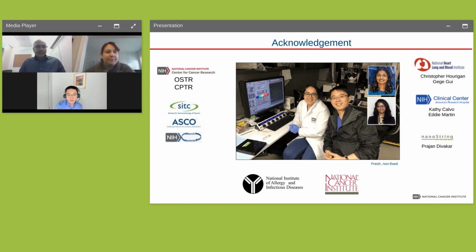Yeah, I think this is a good question. I think there are two aspects. So first, as I showed you earlier, we performed the DSP study on multiple patients, and only 6 patients passed the QC. So first, we only selected the patients who passed the QC from DSP for our CosMx SMI study. And second, the DSP itself also provided a guide to lead our analysis to focus on the T cell transcriptome analysis. So I think these are the two major ways that our DSP study helped our CosMx SMI study.